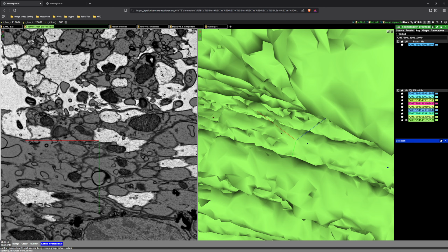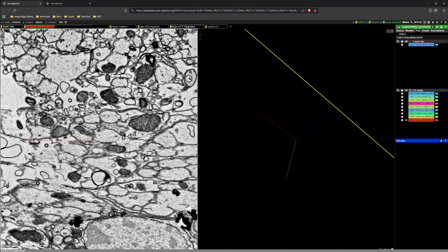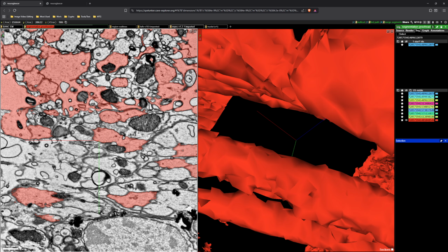And we'll know it's a success if the segment in 3D blinks out of existence, which should happen anytime now. Hopefully. If not, there might be too many mergers in this area, and we'd have to go further up to cut off a good piece.